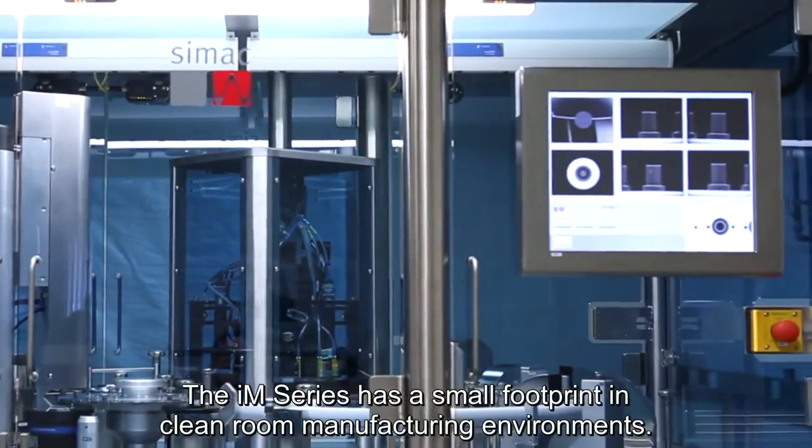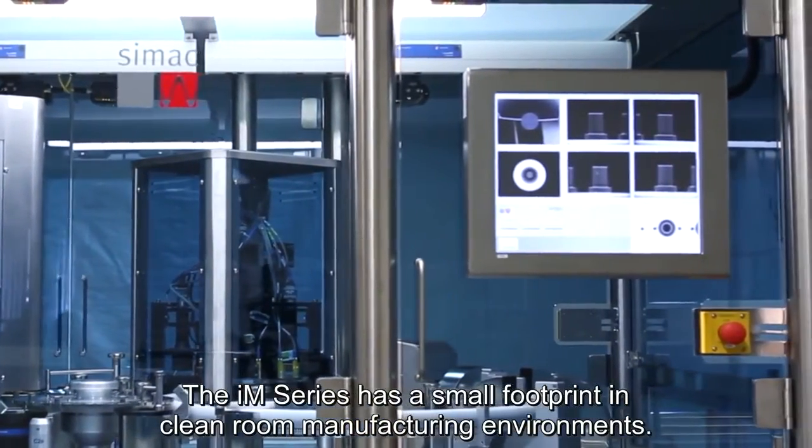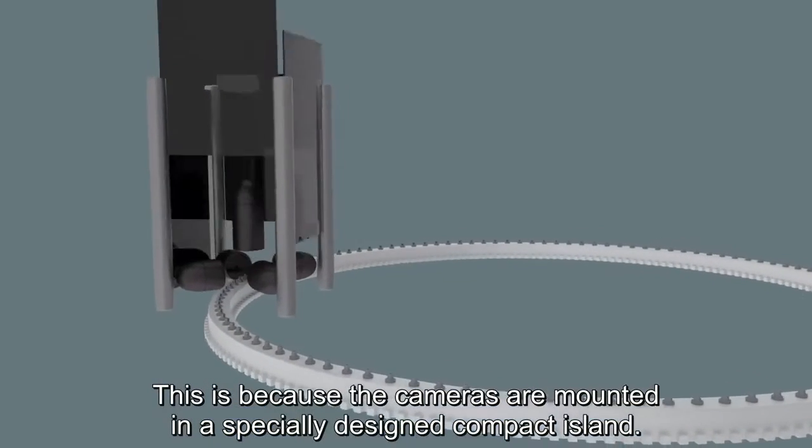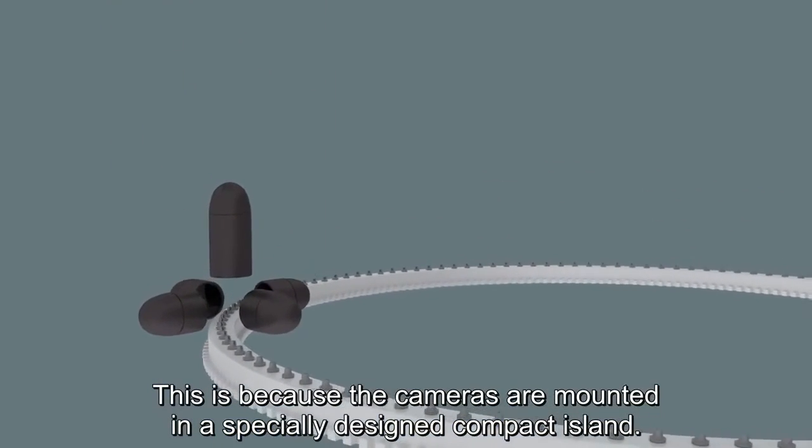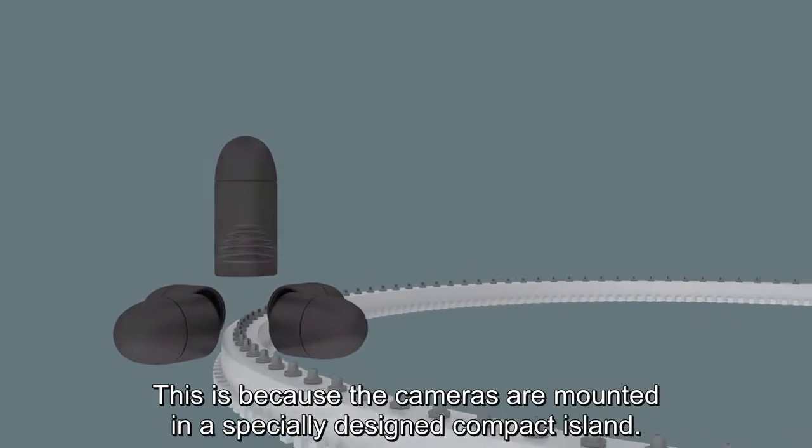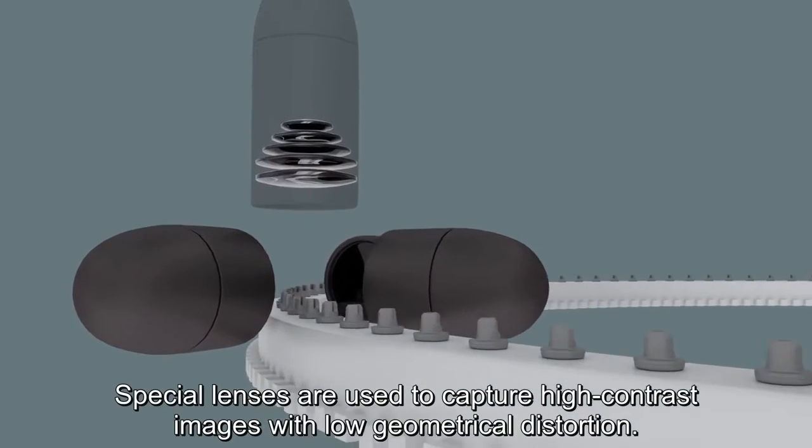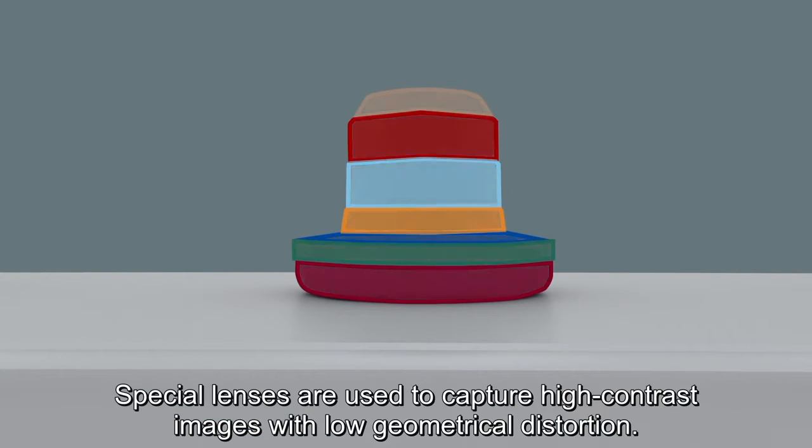The IM series has a small footprint in clean room manufacturing environments. This is because the cameras are mounted in a specially designed compact island. Special lenses are used to capture high contrast images with low geometrical distortion.